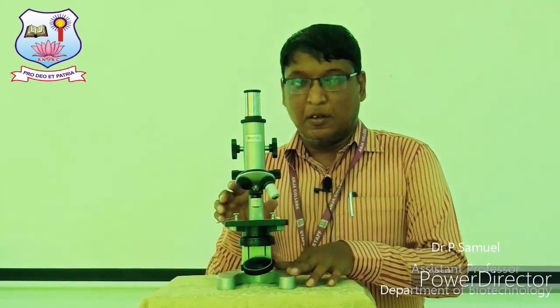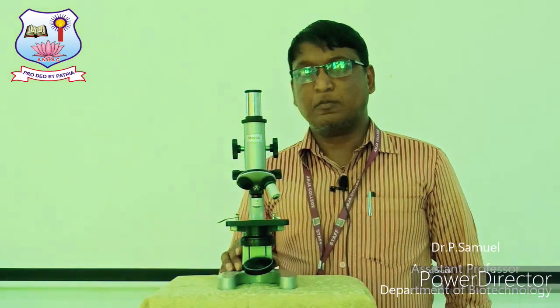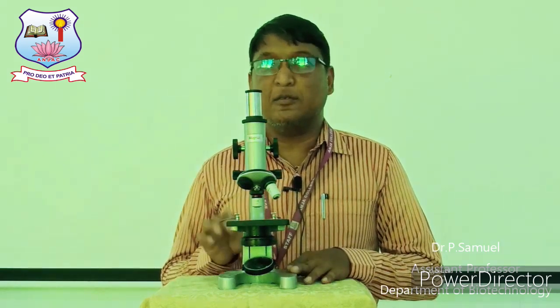Through this video lecture, we are going to see about a very basic instrument called the microscope. This is very common, and as I told you before, a very basic instrument that needs to be possessed by every microbiological laboratory. A microscope is an instrument used to observe objects which are not visualized through naked eyes, which means there are millions and millions of organisms which cannot be seen by our naked eyes. Those organisms are visualized through an instrument, and the instrument is named the microscope.